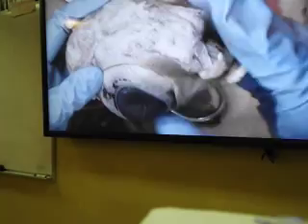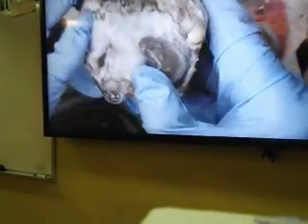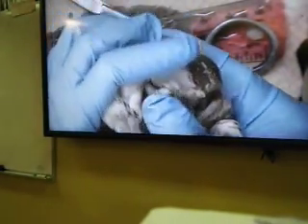Okay, so we see a lot of fat surrounding, some muscle, a little part of eyelid, a little conjunctiva here, which we actually don't need, none of those. So what we want to do is go to the back of the eye. And on the back of the eye, we look for a ropey structure, which we call the optic nerve.